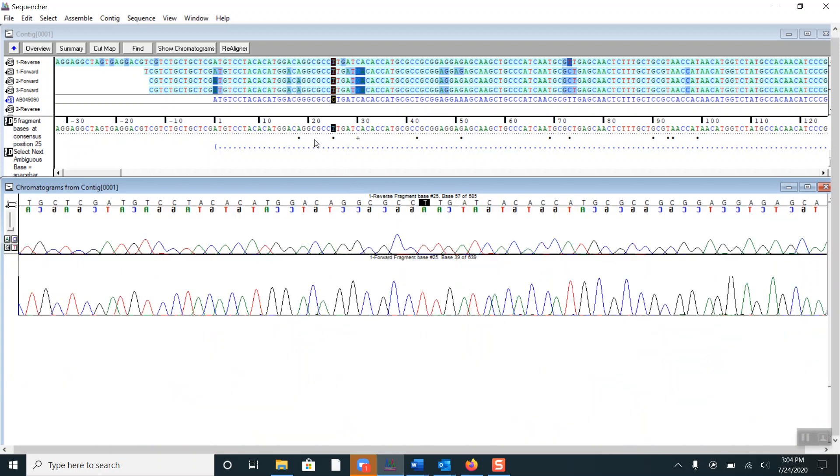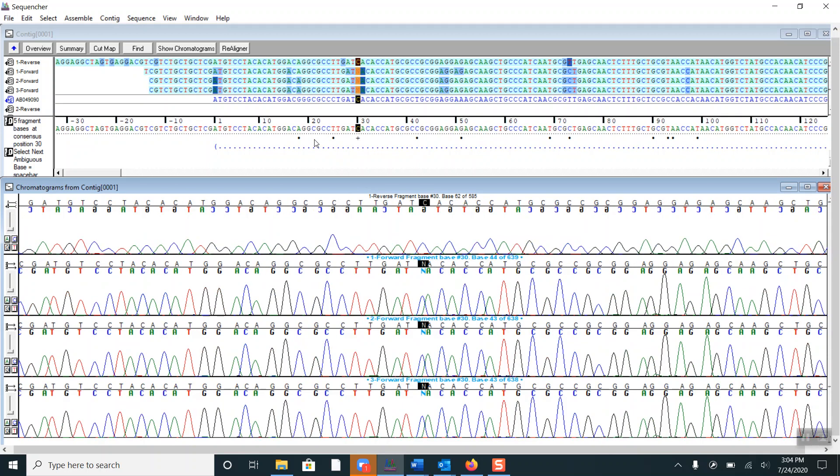If I click on the space bar twice, this will take me to an ambiguity. If we look at the bases here, we can see that the closeness of the A peak is interfering with the base call of the other peaks, which are clearly C's.